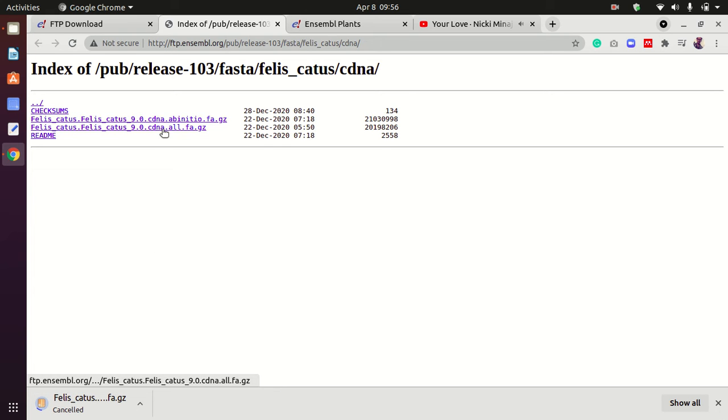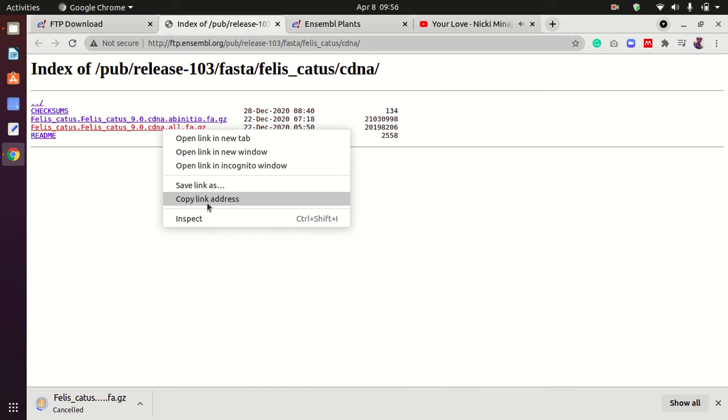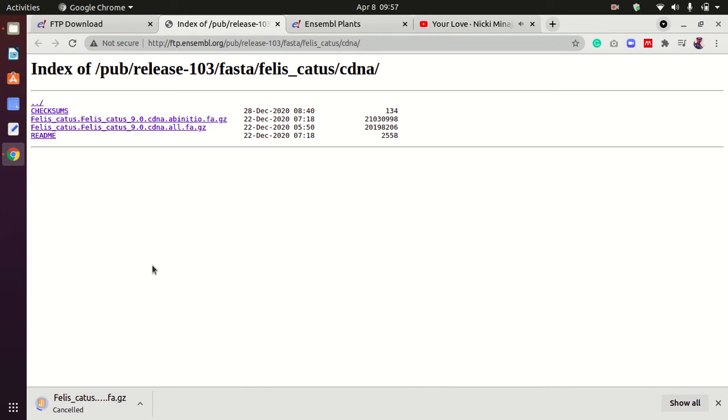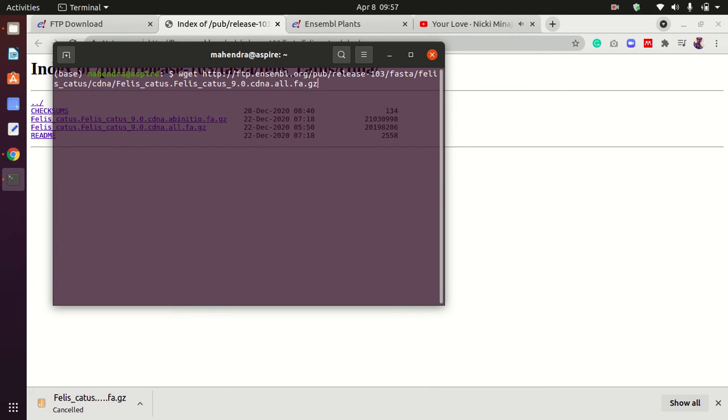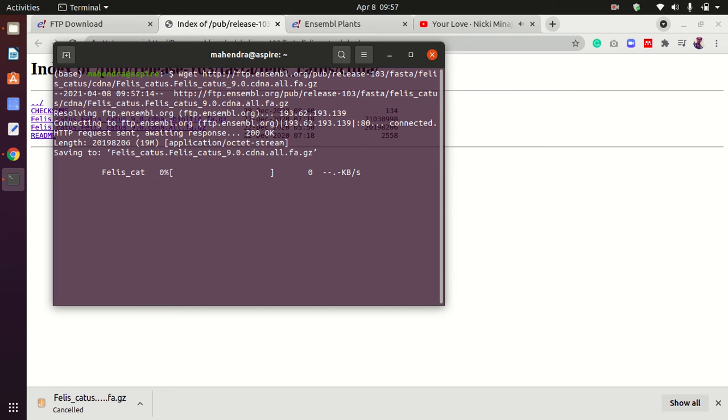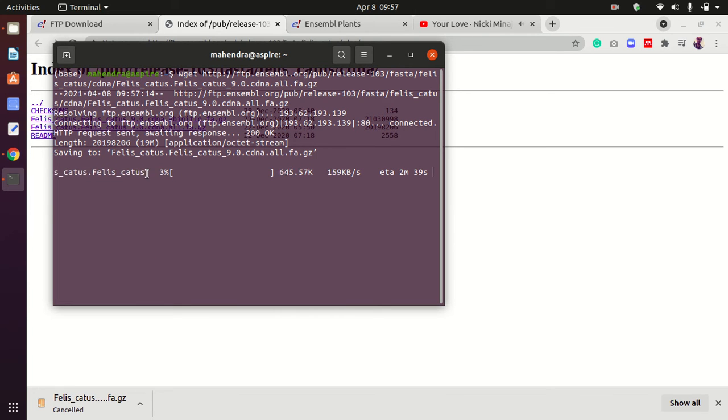If you're going to download using command line, just copy the link and open the terminal. Then type 'wget', paste the link, and hit enter. It will now start downloading here.